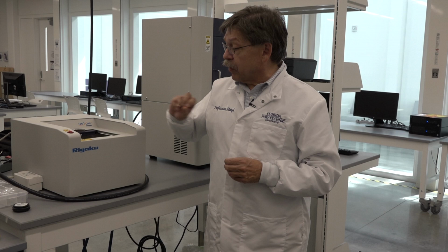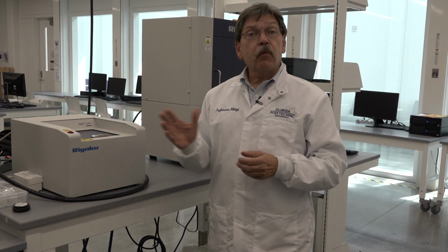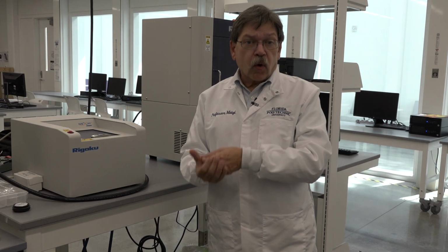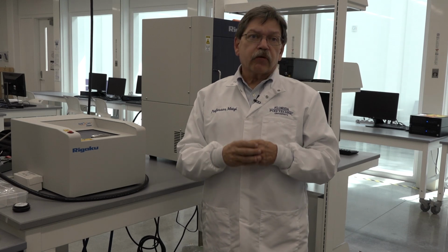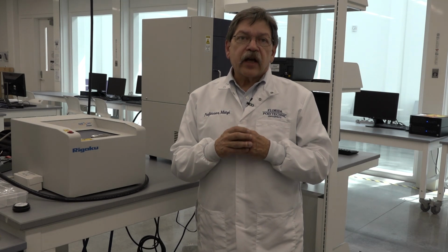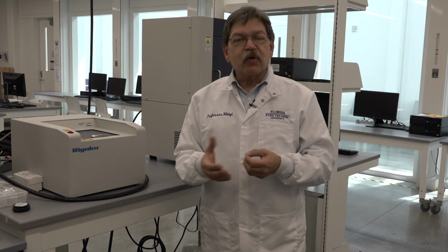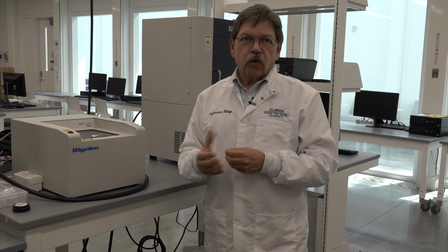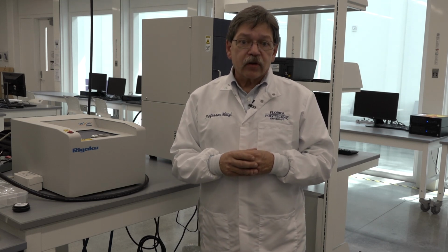You can just open up that door, drop in a sample, close the door, the shutter will open, and we irradiate the sample, and then we record the X-ray fluorescence spectrum. Now, X-ray fluorescence is a wonderful non-destructive way of getting chemical information on solids. For instance, working with phosphate rocks that are mined here in Central Florida, it is an excellent tool for analyzing the chemistry of those input materials.